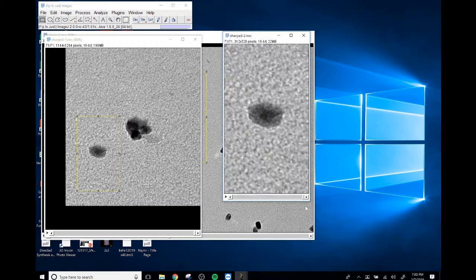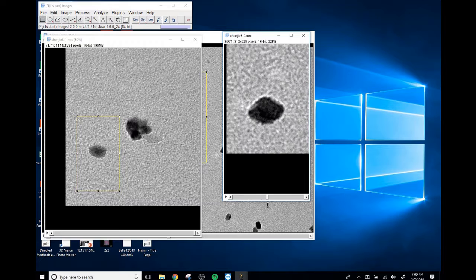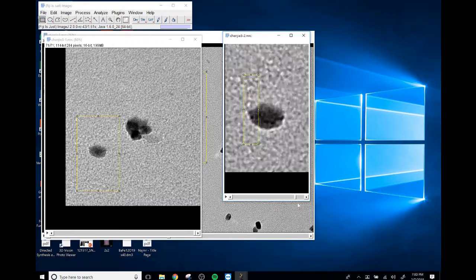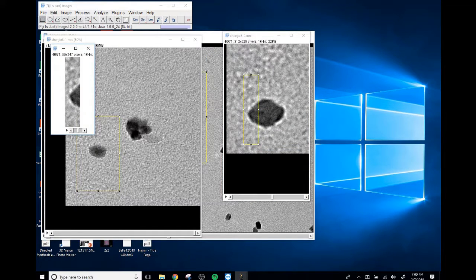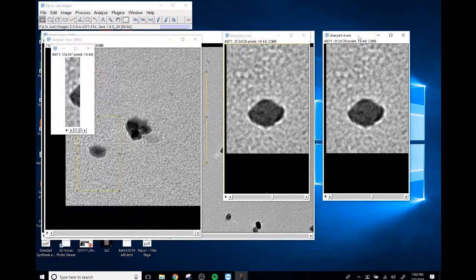But we're going to do one more trick, because I might as well teach it to you while we're here. When things are aligned in one axis, you can do a multi-stack reg based off of one element of the particle that you don't think moves around a lot. I don't think this moves around very much, so I'm going to duplicate this. Again, getting smaller and smaller. I'm also going to duplicate the whole thing, so we can use this later like a clean reference file.